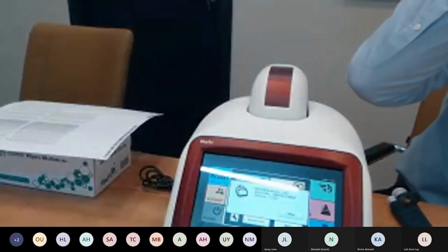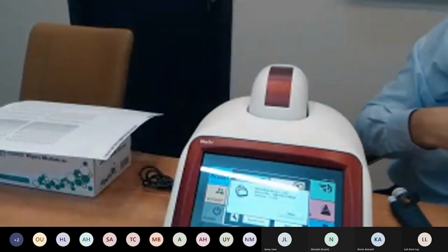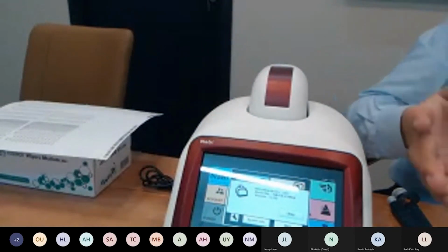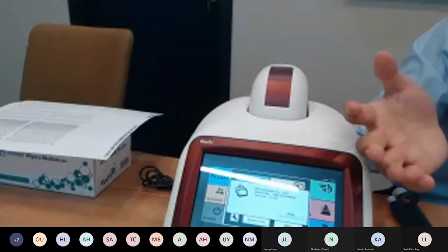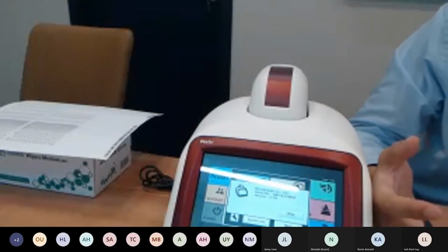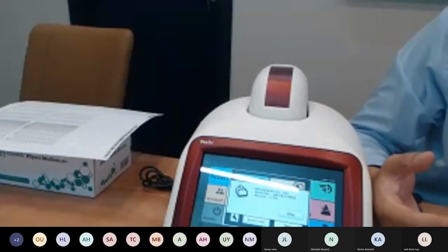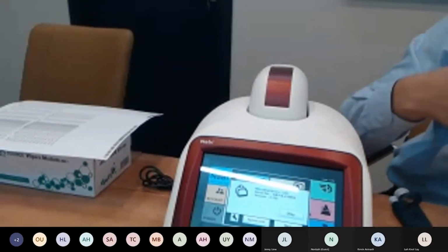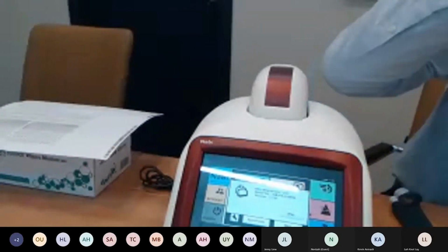We have a new version of software once every 3 months or so that we can, because we get feedback from our users and our partners on features they want to add or bugs that might ever be present in the software, and we usually update them for you if you ever need them.